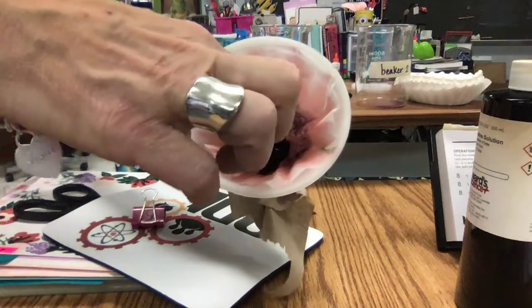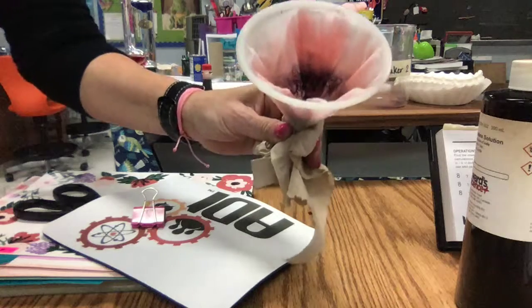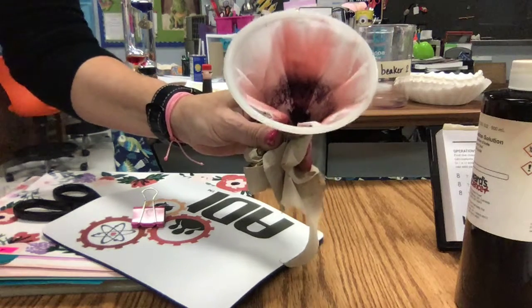Okay, so do you see all that, the purple in there? Okay. So, I just almost poured that onto my new computer.